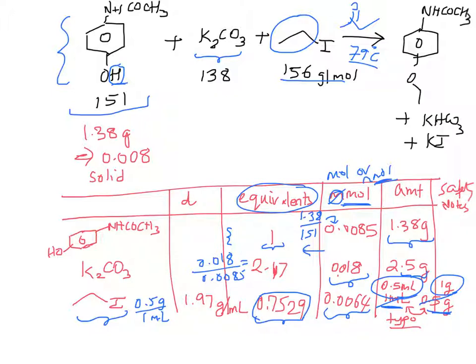Well, one way that you can increase the yield is by increasing the equivalence a bit. From 0.75, you can use 1 as well, but know that any reaction can sometimes get stuck in an equilibrium, and if there is leftover ethyl iodide, then you don't want to inhale that. It's a toxic chemical, right? So we will try to keep it less than 1, but we will go up to probably about 0.95 or so. So we'll increase that a little bit. That will be one change that I would want you to make.